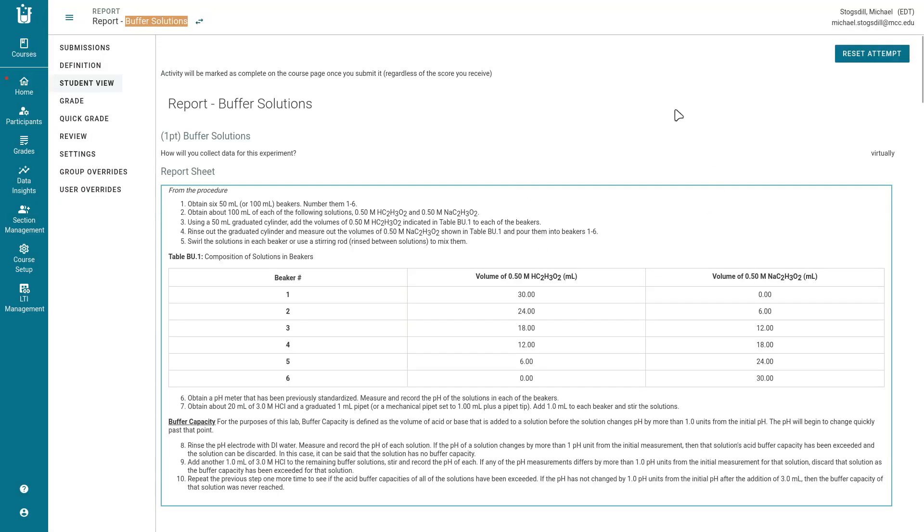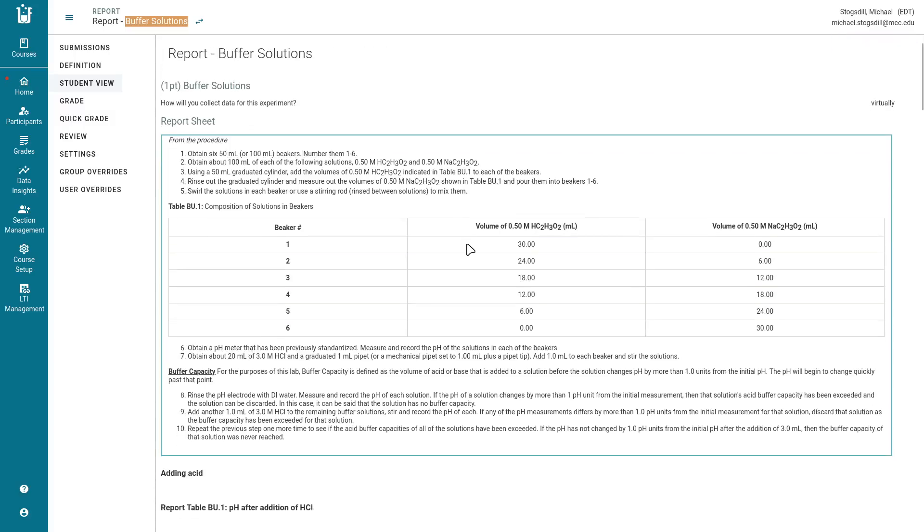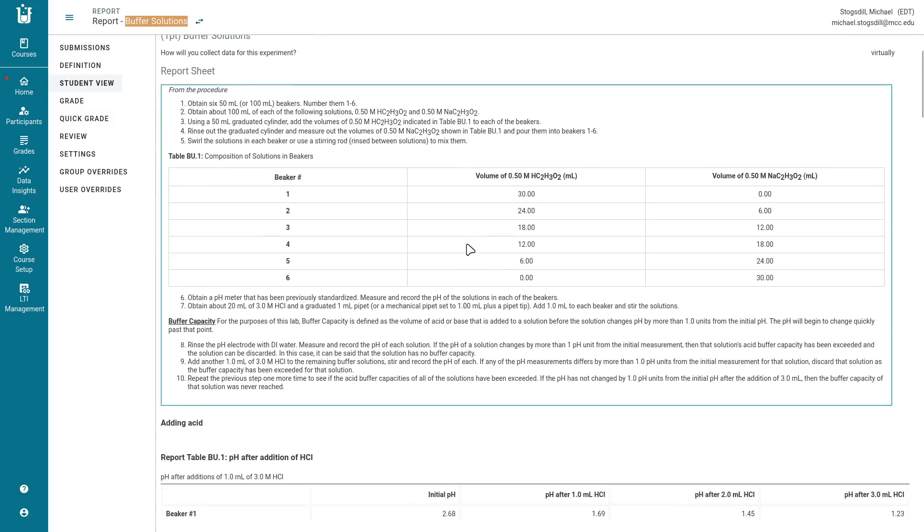The first thing that you're going to do is you're going to go through and it's got a picture of a little handheld pH meter with a reading on it and you're just going to record that. Once you pass that you're going to get into the bulk of the report here.